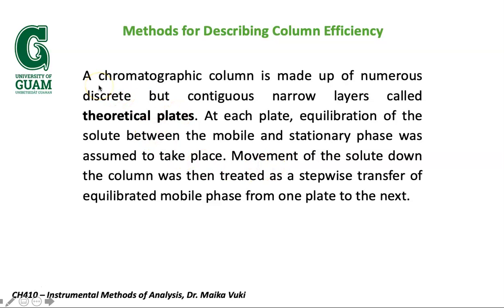In a chromatography column, we say that it is made up of numerous discrete but contiguous narrow layers called theoretical plates. As I say, these theoretical plates are not physically delineated or established in each column, but we can use a simple empirical relationship and obtain some of the quantities and values of these theoretical plates. The movement of solute down the column is then treated as a stepwise transfer of equilibrated mobile phase from one plate to the next.